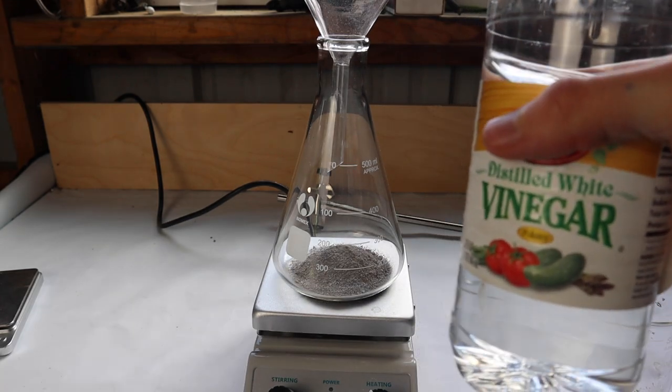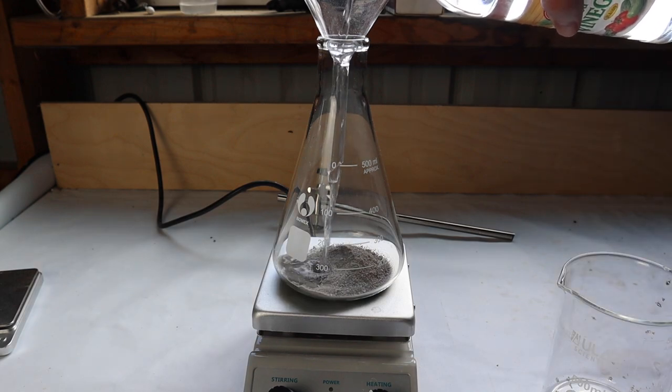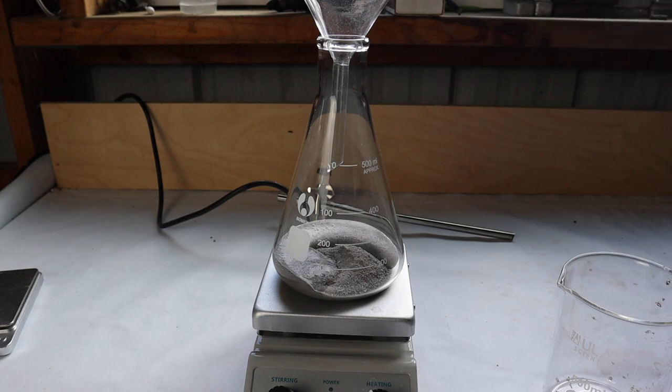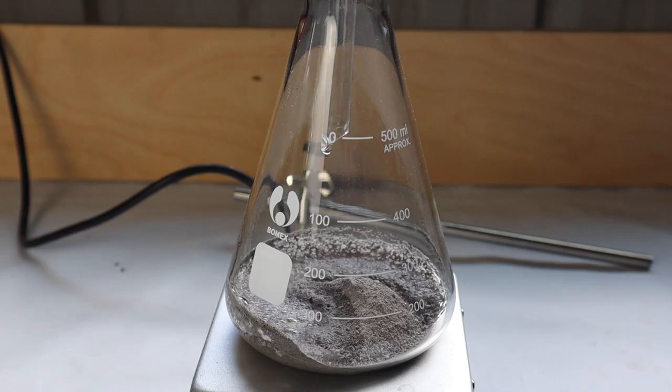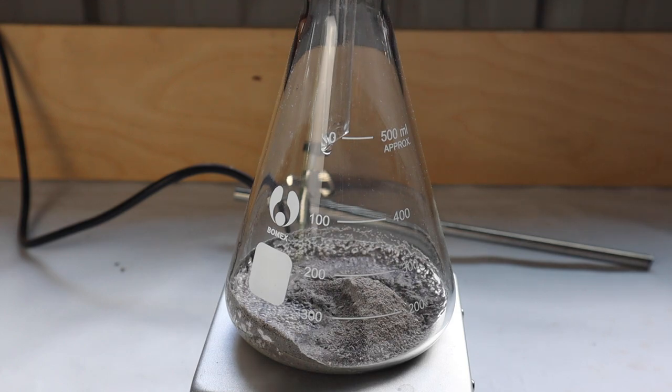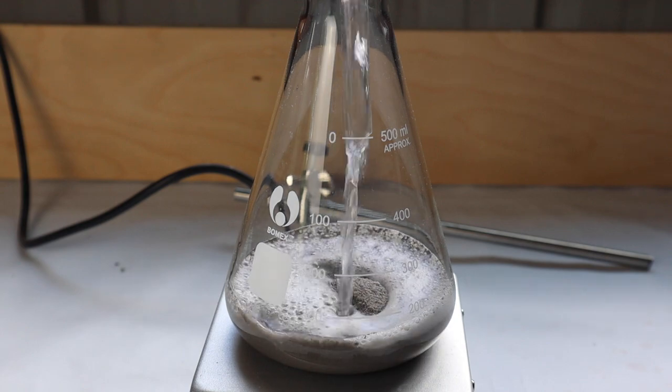I'm going to slowly pour in the vinegar now. You can see immediately why we can't pour it all in at the same time. It starts foaming a lot and given how small my flask is, probably wouldn't be the best idea to pour it in quickly.